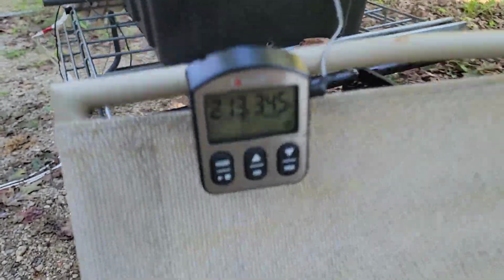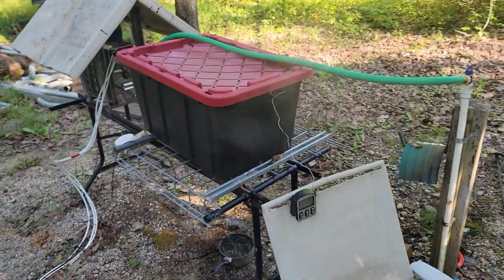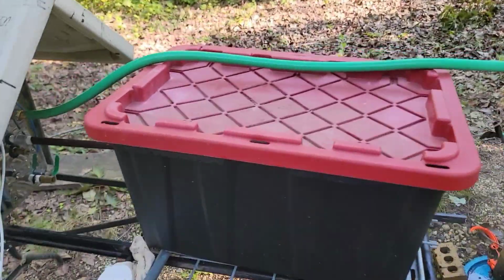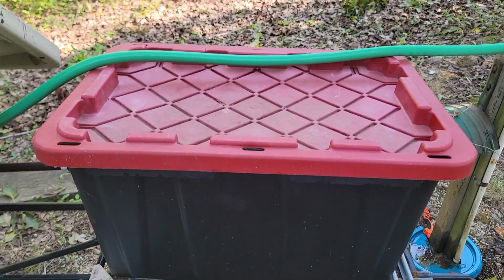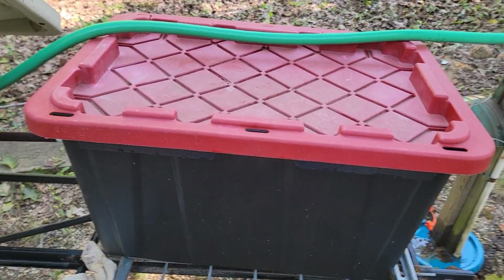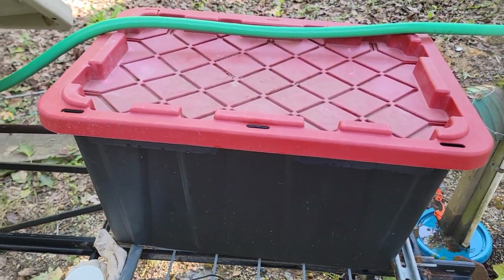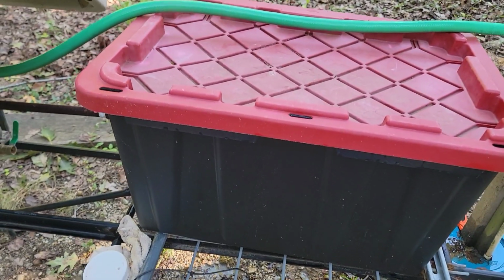Let me grab your attention for a minute. You see that temperature right there, 213 degrees Fahrenheit? That makes me happy seeing that. Now, some of you will be like, well, it has no pressure and it's not 254 degrees Fahrenheit. I understand, but what you don't understand is really the only things that are living right now would be endospores and hyperthermophiles, or however you pronounce them.